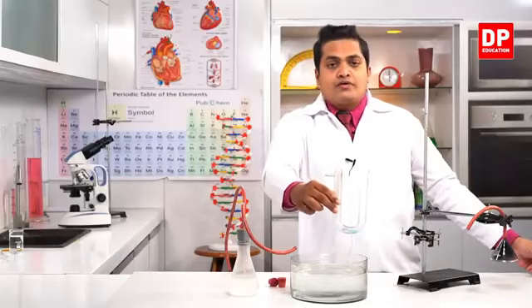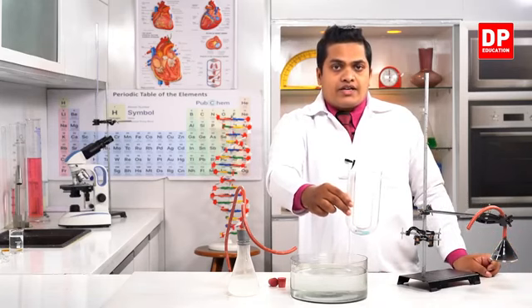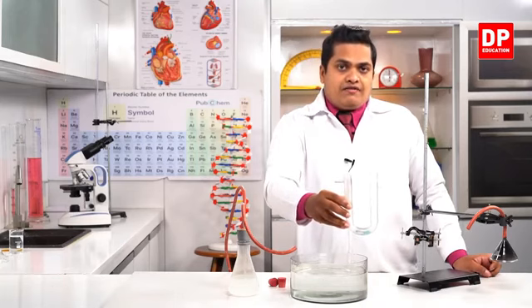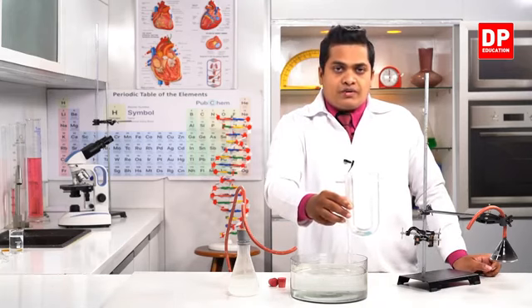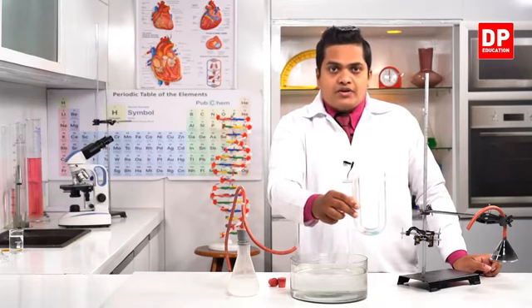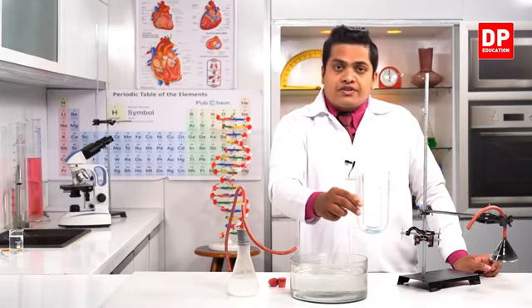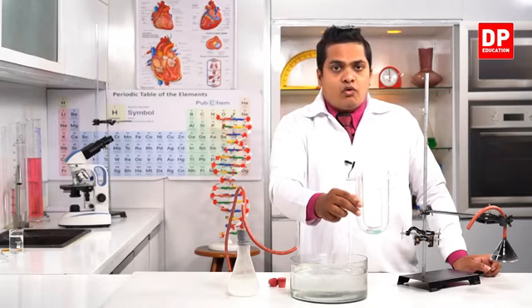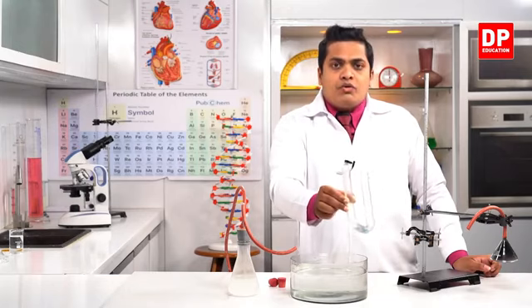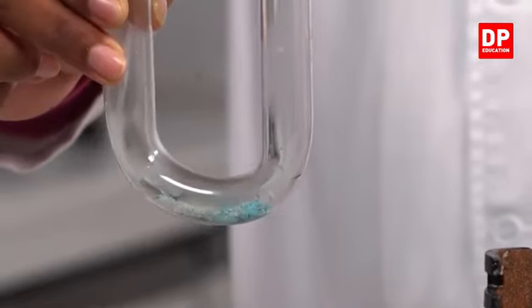So the original color of the copper sulfate was white. White color copper sulfate means anhydrous copper sulfate. White color means anhydrous. There is no water. So when white color anhydrous copper sulfate comes in contact with water vapor or water, it's getting converted into blue color like this. So this is called hydrous copper sulfate.